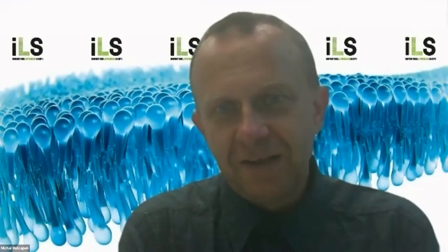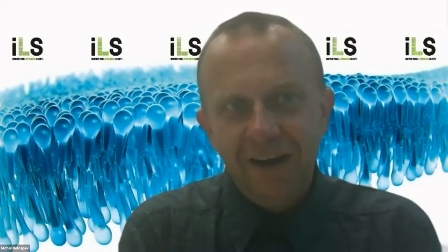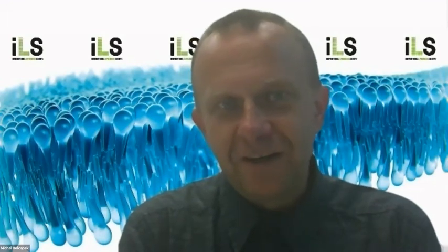If you use it offline, then you may do very detailed identification, but it's laborious and time consuming. If you do it online, then you have dilution in two dimensions, and it means that you will identify and quantify much fewer lipids, I would say about one third. Yeah. And it's really a difference whether you quantify 400 lipids or 150.